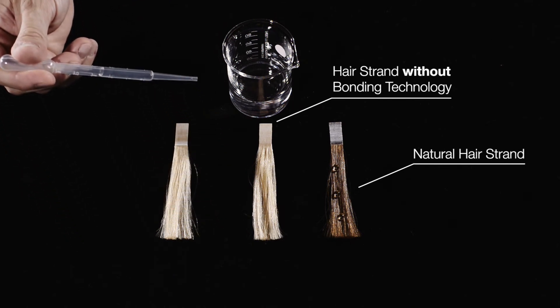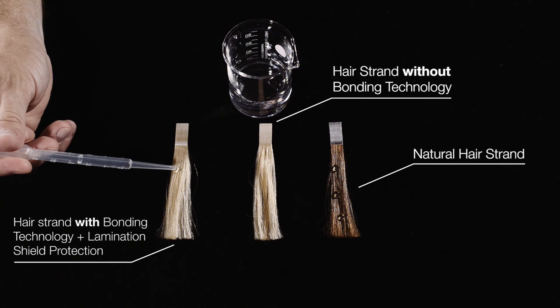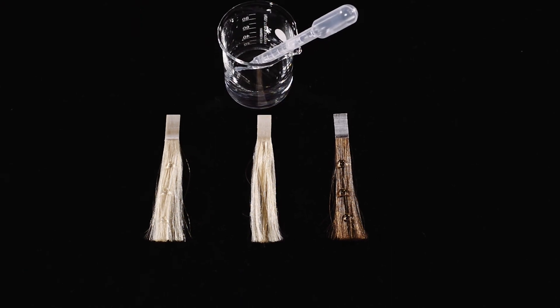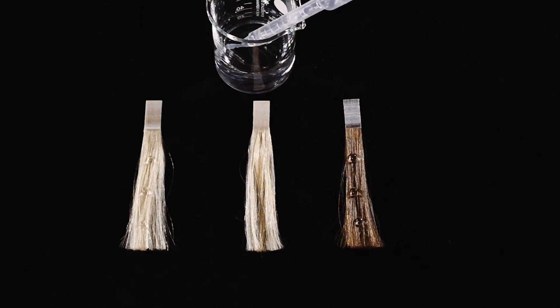On the left hand side you can see a damaged hair strand that had been treated with BC Fiber Force, creating a lamination shield protection. As you can see the water droplet stays on the surface without penetrating. This means that the hair surface is sealed and protected again.